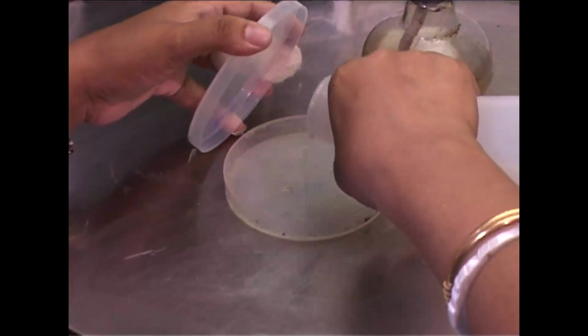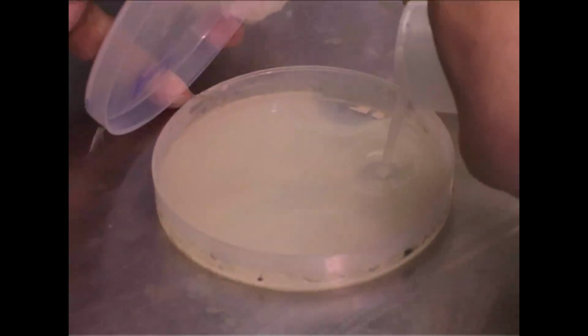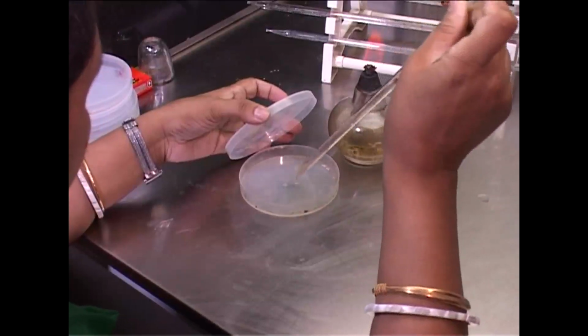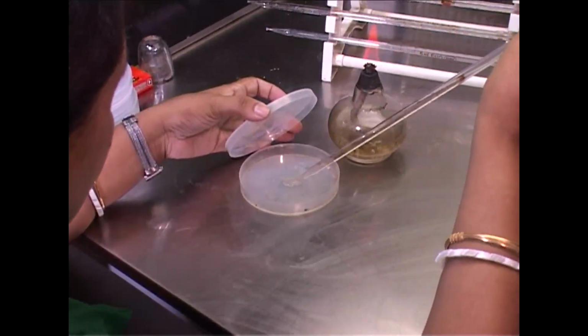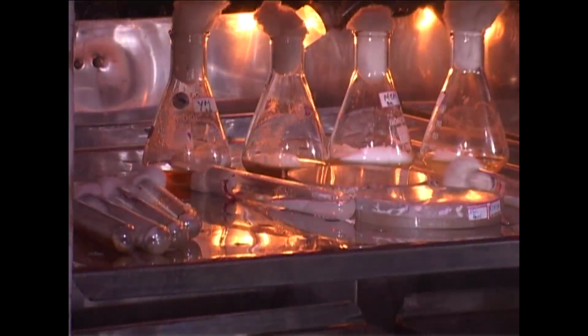After the serial dilution technique, we will follow a plating technique. We will take melted agar in tubes and pour it into the petri dishes. The petri dishes taken should be sterile. Take 0.5 ml of sample from each of the dilutions that you have made and add it into the petri plates. Then it is rotated clockwise and anti-clockwise so that the sample mixes well, and then it is allowed to go into the incubator, where it is kept at a constant temperature around 20 to 25 degrees centigrade.